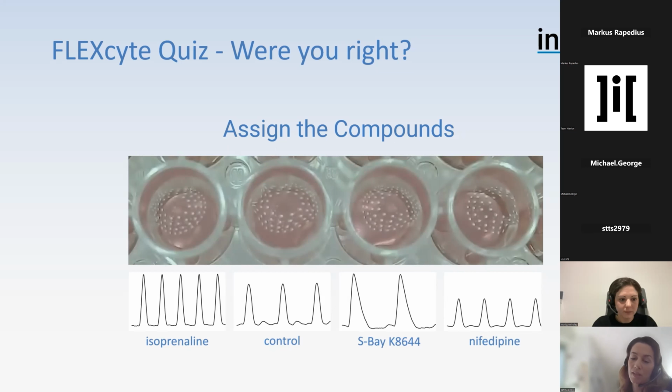And also just to save cells, because especially the commercial ones can be a bit expensive. So you kind of have to find the right way in the middle. So what we present is monolayer. Okay, thanks.